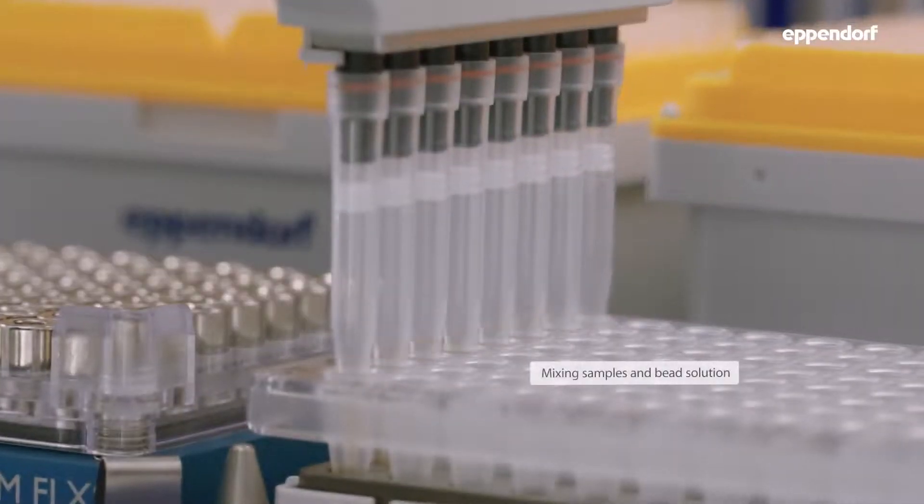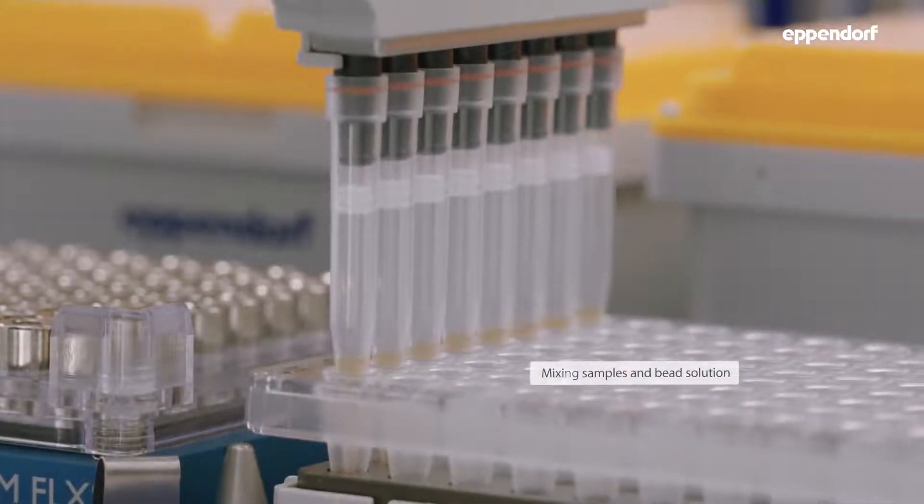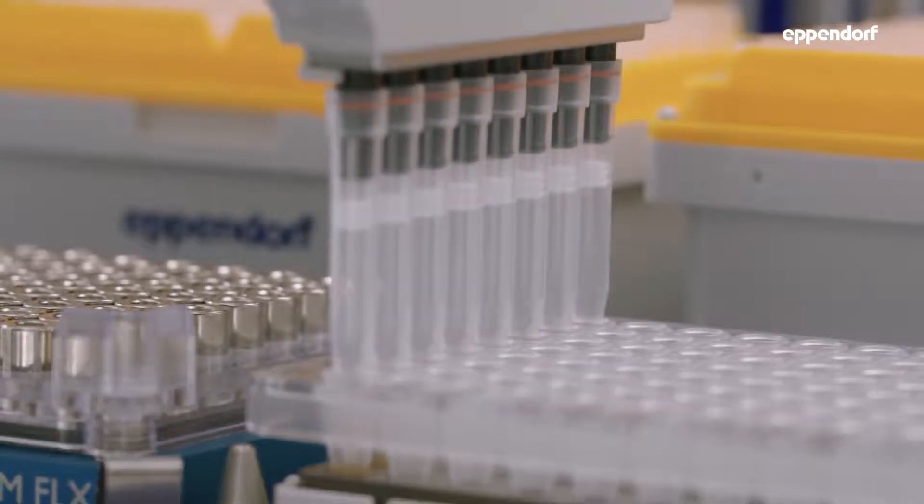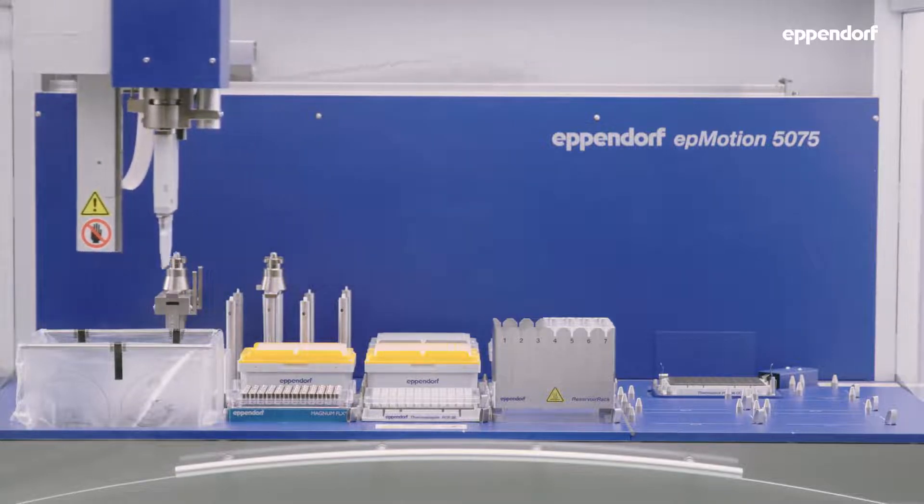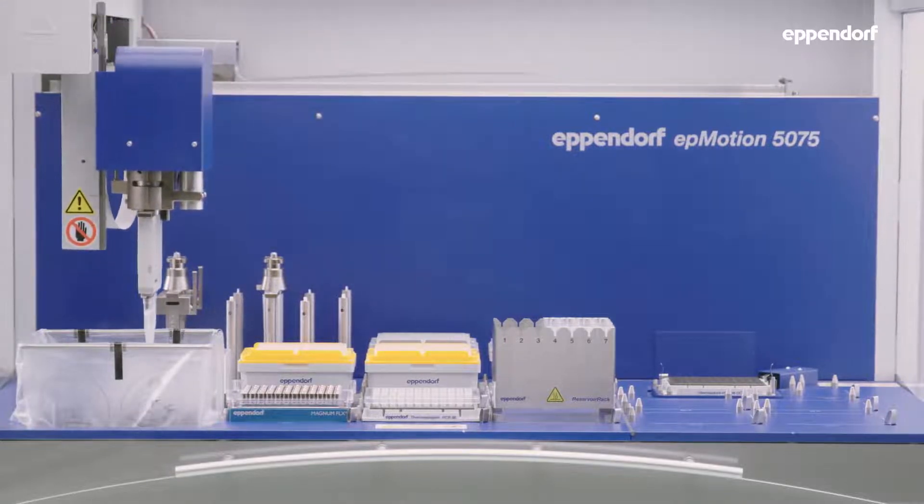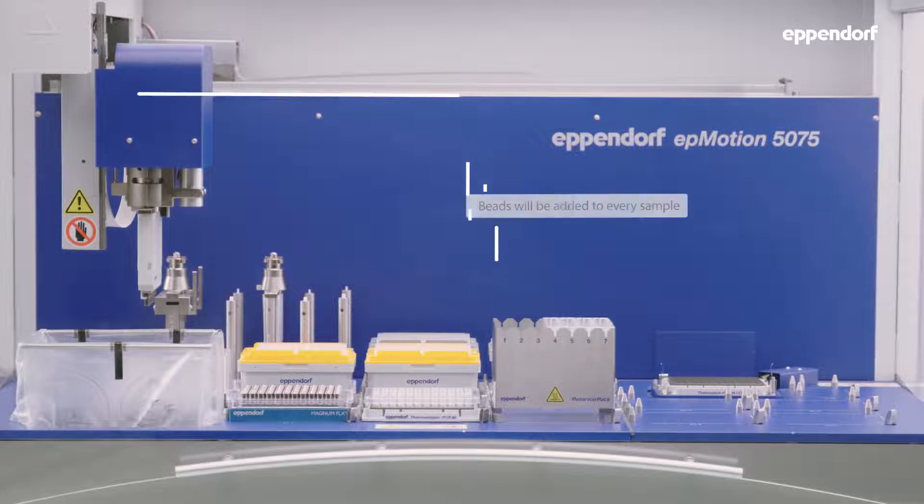After adding beads to the sample, both components are mixed in the pipette tip to allow proper binding of the sample to the beads. This process is then repeated for every sample.